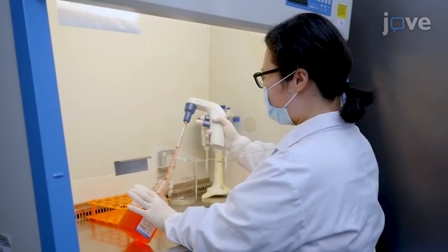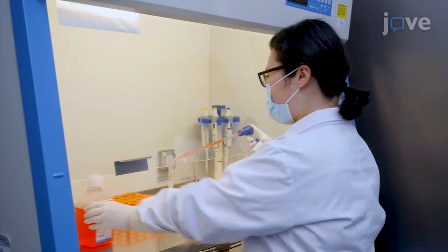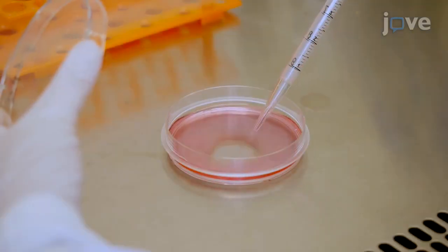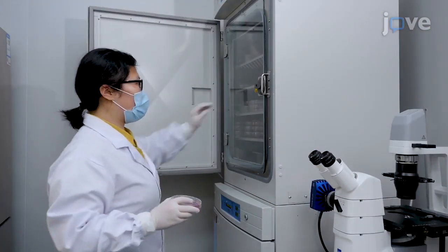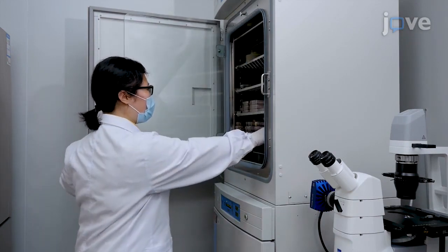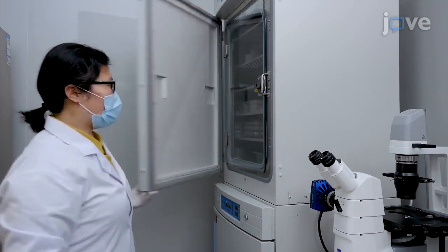To generate lentivirus particles, seed 293T lentiviral packaging cells into a 100 mm Petri dish with 10 ml of DMEM supplemented with 10% FBS. Incubate the cells overnight at 37 degrees Celsius and 5% carbon dioxide, making sure that the cells are 50 to 80% confluent on the day of transfection.